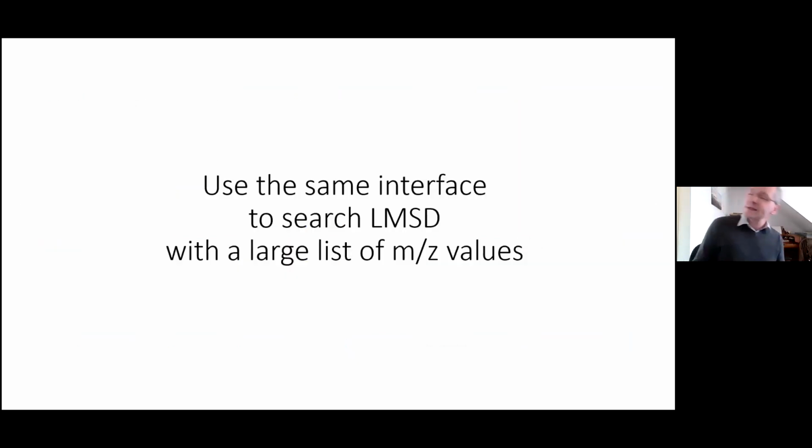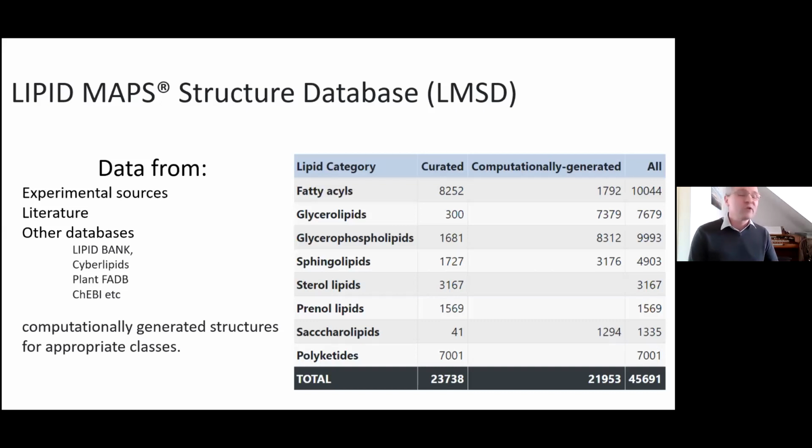You can also use the same interface to search the LMSD database with a similarly large list of m/z values. So that brings me on to talk about our main database really in LIPID MAPS, the LIPID MAPS structure database, abbreviated to LMSD.